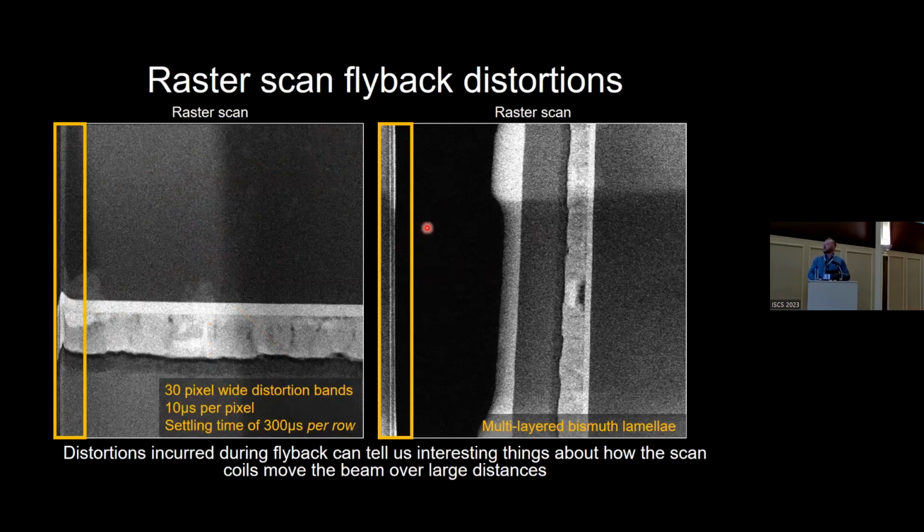If you rotate the scan, you can see here we have a nice reflection of the image. So this is, again, the beam moving from the right to the left. It's acquiring data, it's ascribing that data to these locations, because as we said, we're not doing a wait and hold on the flyback because we want to go fast. And we get a reflection in the image. And this is not good.